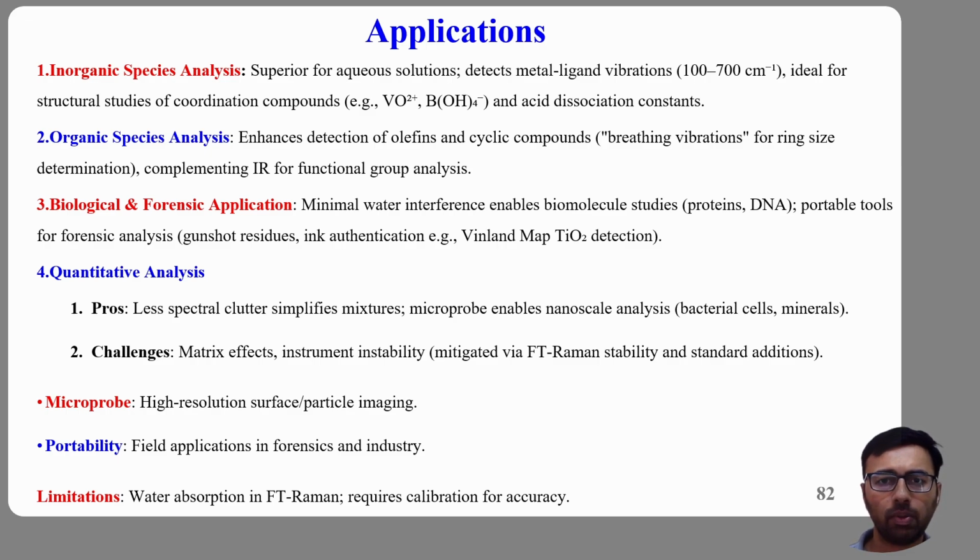Raman spectroscopy is fundamental in modern nanotechnology. It is heavily used for studying graphene, carbon nanotubes, semiconductors, battery materials, and thin films. The famous G and 2D bands in graphene research are Raman features. Environmental scientists use Raman spectroscopy to study pollutants, microplastics, water contaminants, and atmospheric particles.